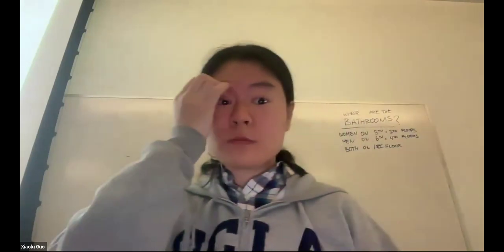Okay, some more about PCA from last time. Some analysis shows that PC1 strongly correlates with the fraction of zeros.